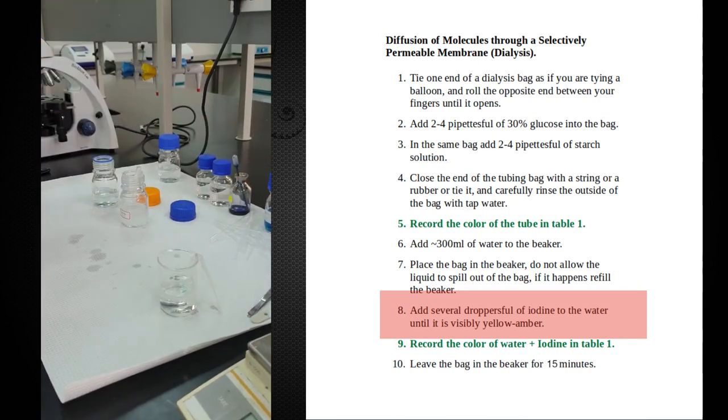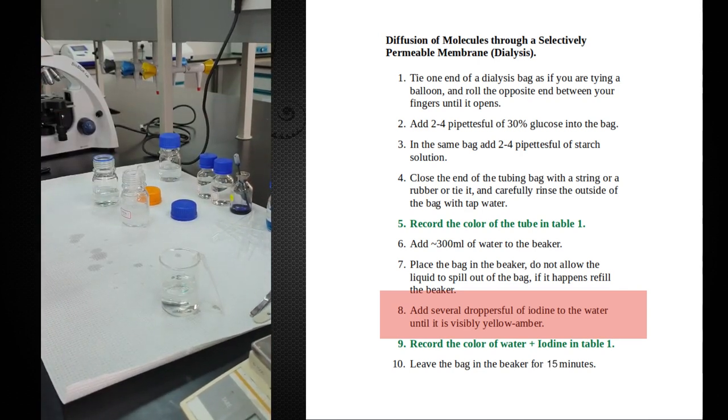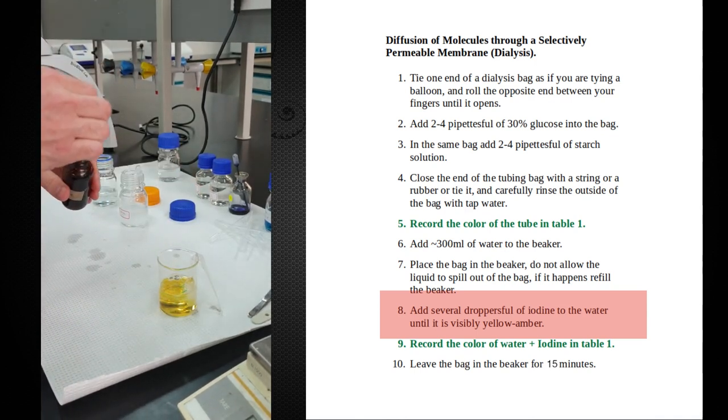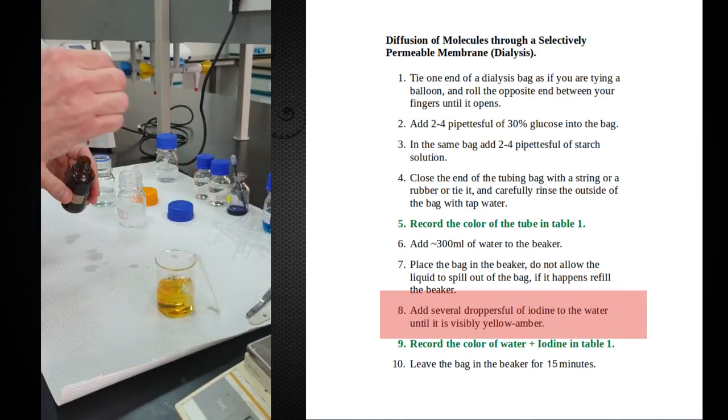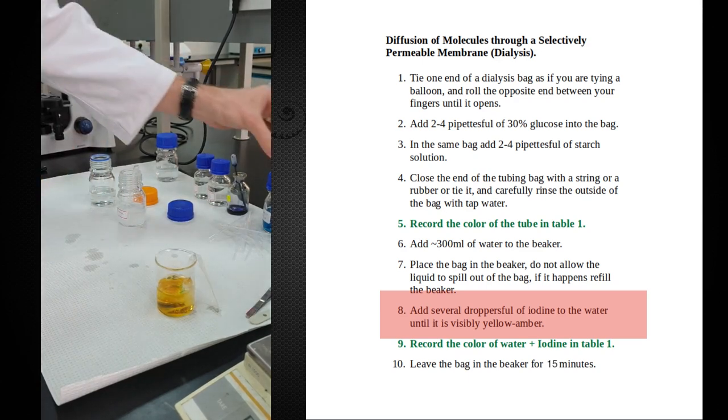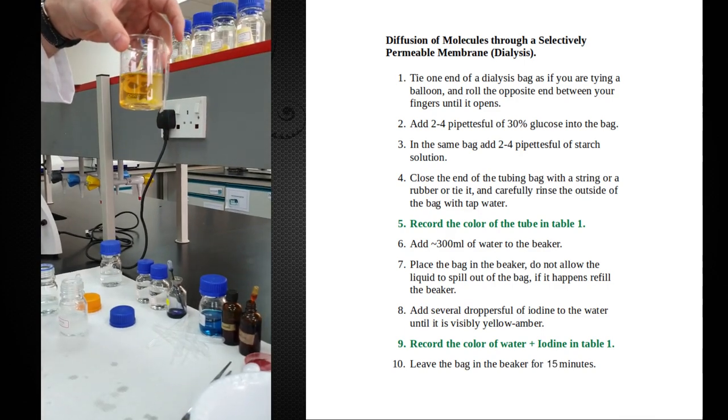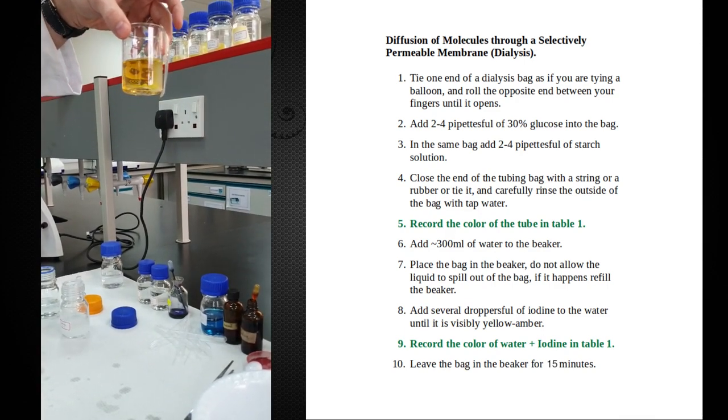And we're going to add some iodine to this. The reason we're adding iodine is because we want to be able to test for the presence of starch. Put in a decent amount of iodine. Don't just put in two or three drops. Make sure that the water looks nice and yellow. Once you have it looking like this, you can set it aside for about 10-15 minutes and we'll see the results afterwards.